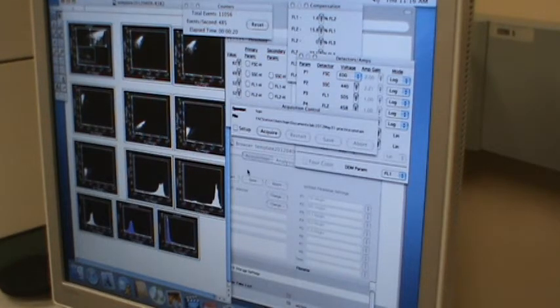And we want to do this as quick as possible. Pull the base aside and pull this tube immediately back. Pull this aside. Pull this one back. Put this one here and switch. I'm not sure how long it takes, but do it as fast as you can.